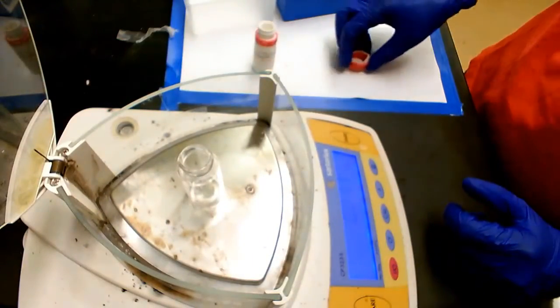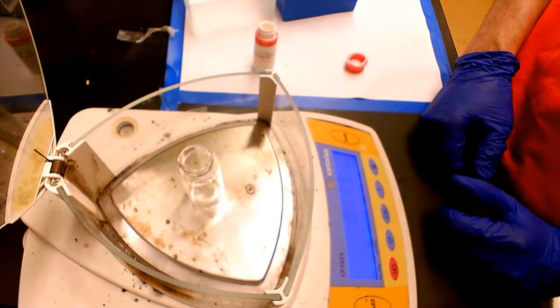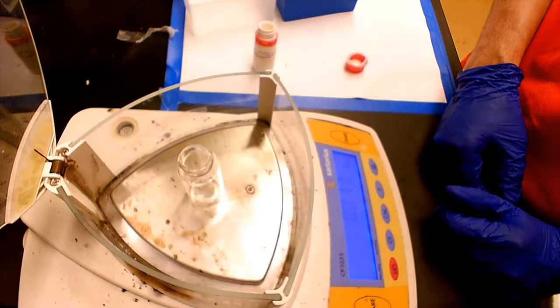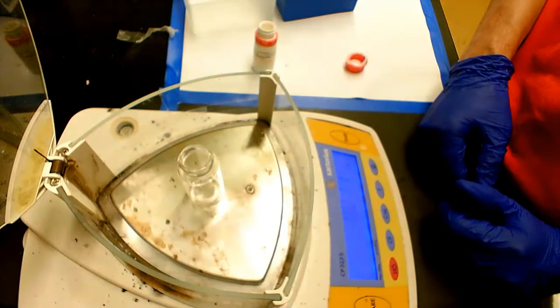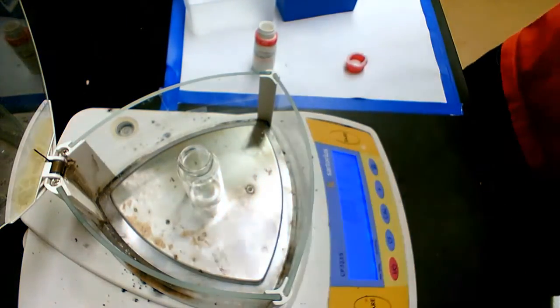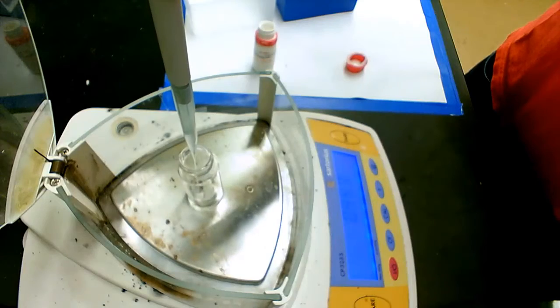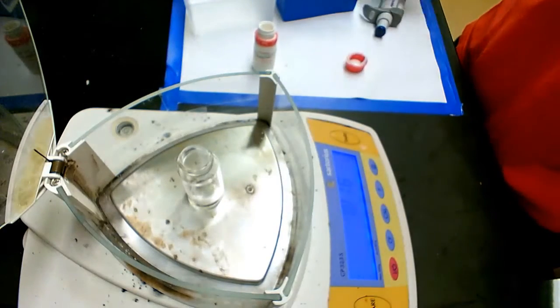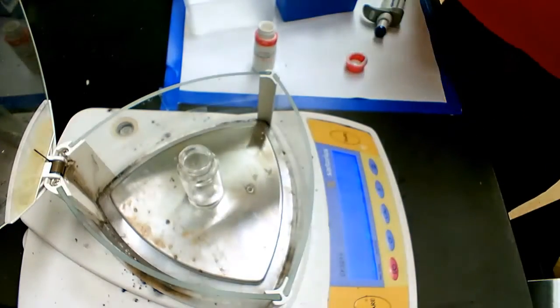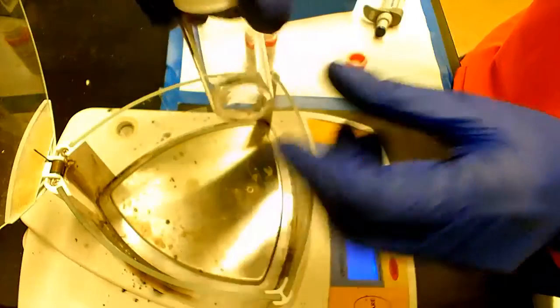So I will stop here, and next you get the solvent. In our case, we always use water to get our PEO stock solution, but for other polymers it can be toluene, THF, and so on. So now I'm going to grab the amount of water I need and add water into this vial. Then I'm going to use a lid and close it. Make sure you add the correct amount of solution you need.